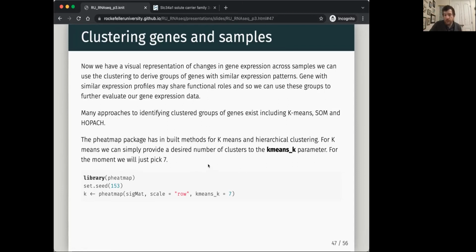Both can work very effectively. If you're not sure what to do for your data set, you can always talk to us, but I'd say most of the time it shouldn't matter too much, but you can run both to do a comparison. But you can still do the k-means also with Heatmap, okay? And so the nice thing about this is your statistical analysis is tightly tied to the visualization. And so it's a nice conversation between the visualization and the statistics.